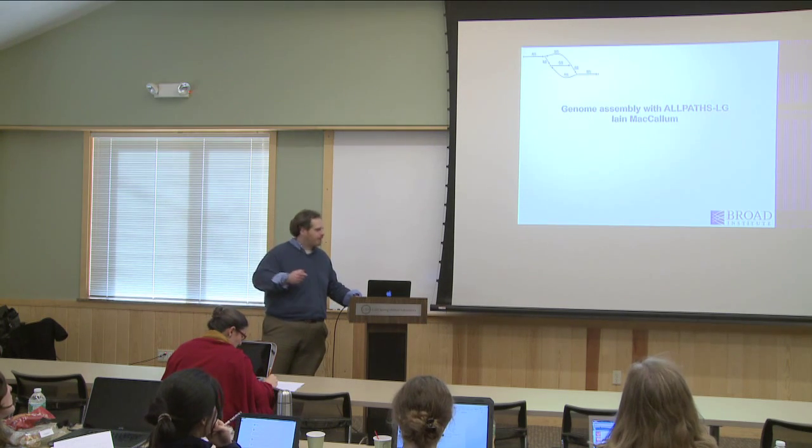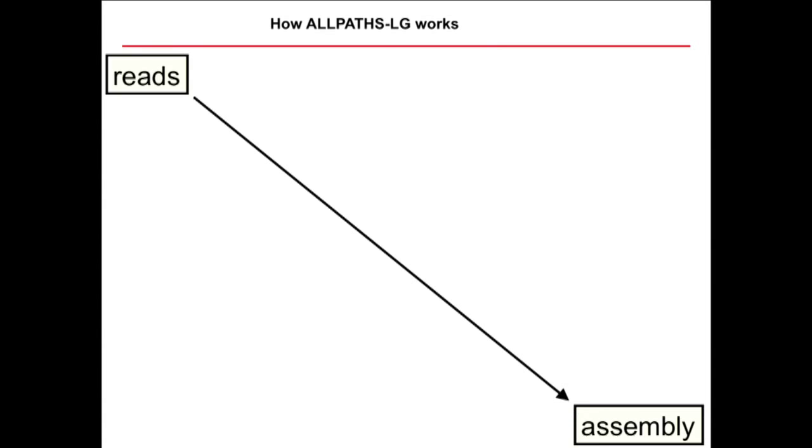So I'm going to give you just a five-minute description of how ALLPATHS works, just so you have some familiarity with it. So of course, the ultimate goal is to go from unassembled reads into some major assembly, but there's a couple of sort of landmarks along the way, along the path. So the first major milestone is to be able to build up those initial contigs, which in the parlance of ALLPATHS are called your unipaths.